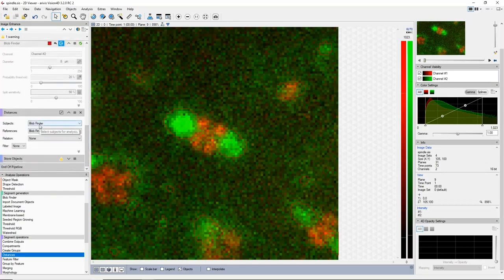So I forgot to rename my second segmenter. So my bad.